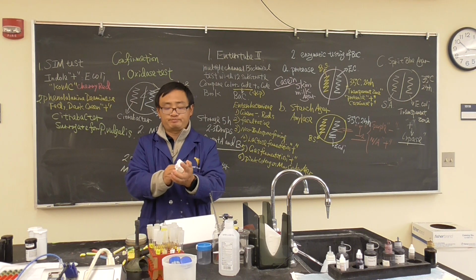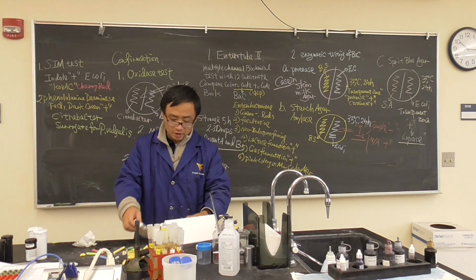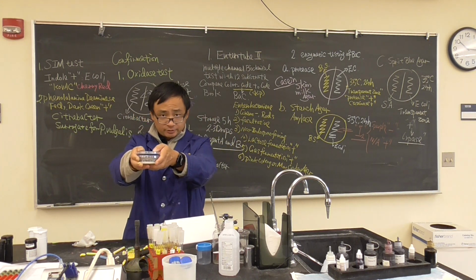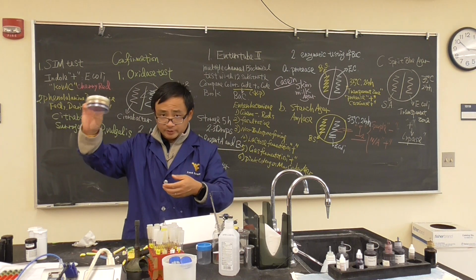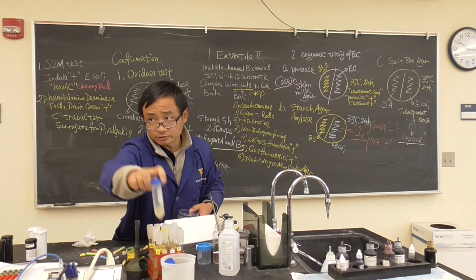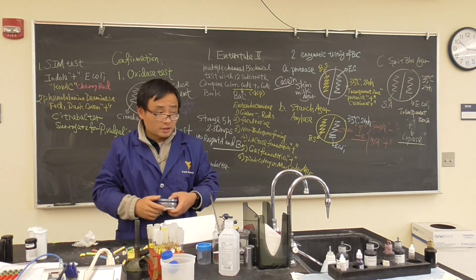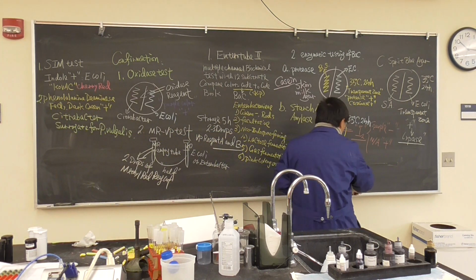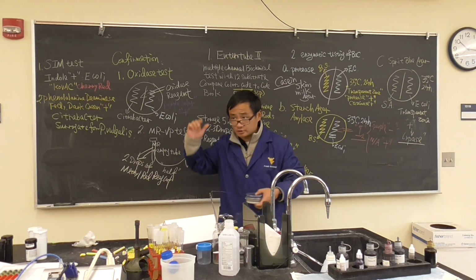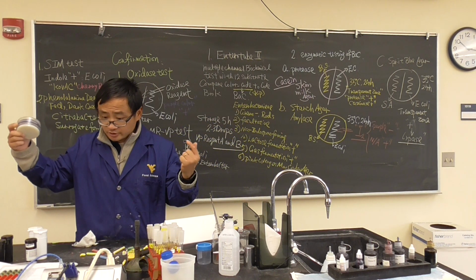You'll get bacteria everywhere. And after you do the inoculation, please just hold it like this for a little bit, then give it to the TA. Don't flip it over immediately, because this is liquid. Okay, this is liquid, remember? If you flip it, it goes everywhere. Then you're going to find a big line of Staphylococcus aureus on Thursday. There's no way to do the test. The whole plate is positive. So these are some of the techniques you should know.